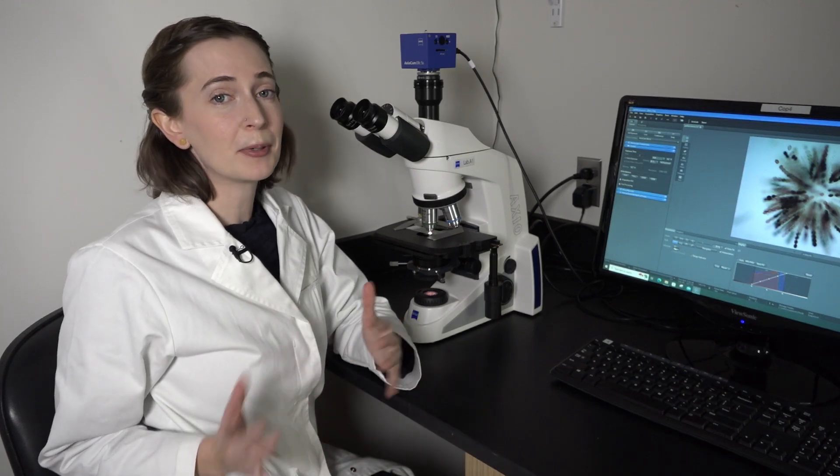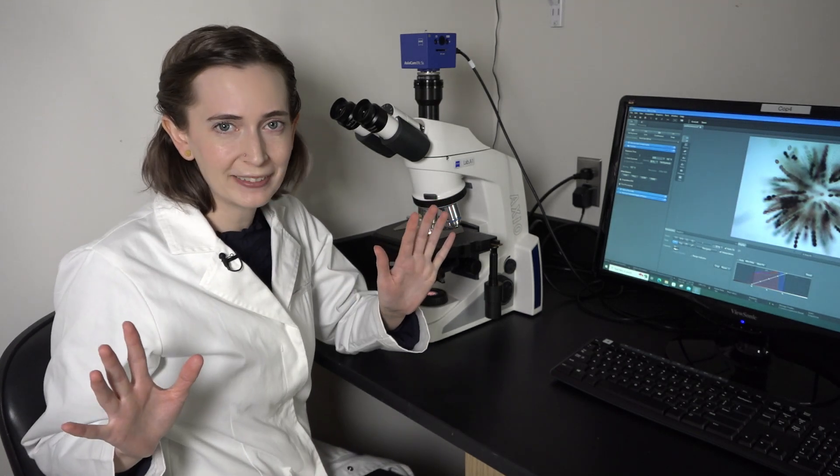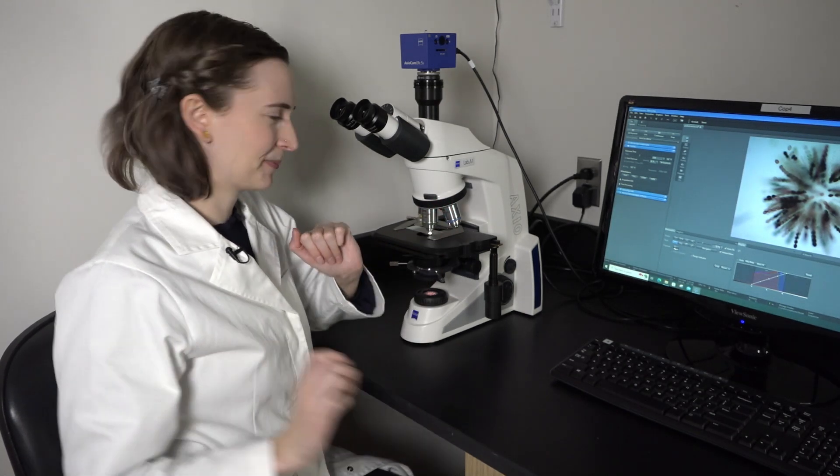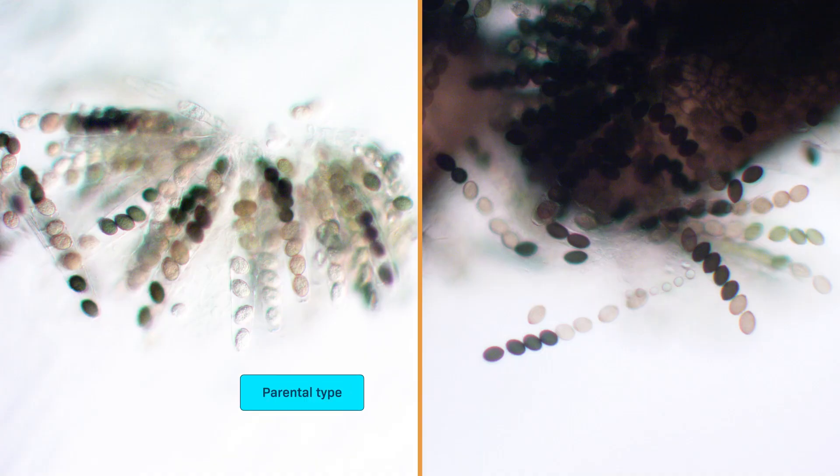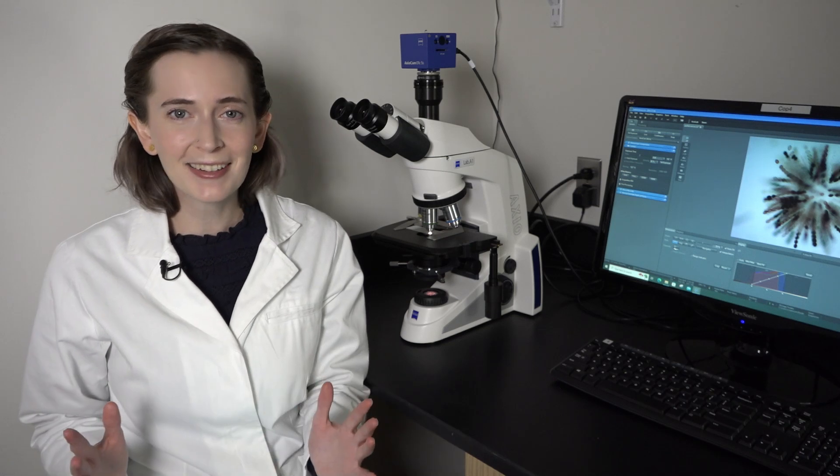Now that we know the difference between parental type and recombinant type, let's see if we can identify them in the wild. On our microscope slide. Oh, here's a parental type ascus. I can see the four tan and four black spores lined up in a row there. And here's a recombinant type. Look at those black and tan spores all mixed up like that.